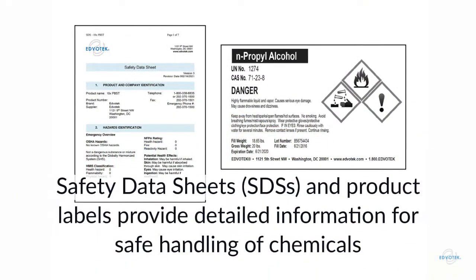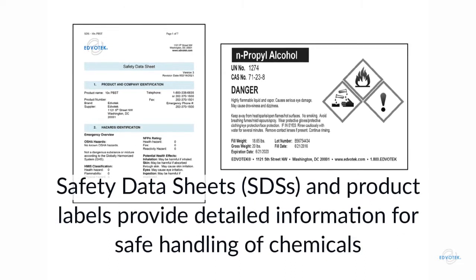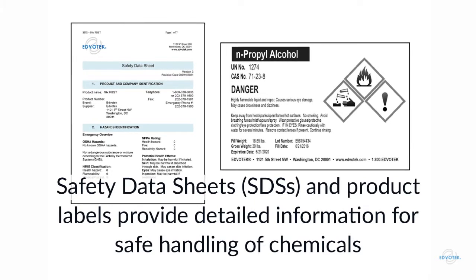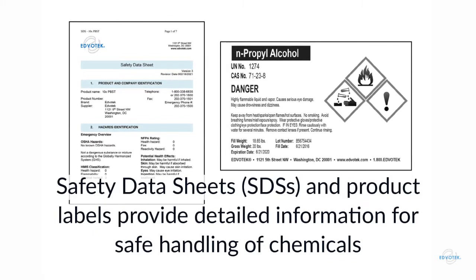Safety data sheets and product labels provide the detailed information we need to safely handle chemicals in the laboratory. Each resource includes standardized signal words, pictograms, and precautionary statements. These simplified documents help reduce confusion and ensure that products are used in a safe manner.